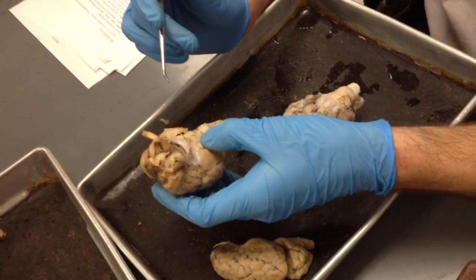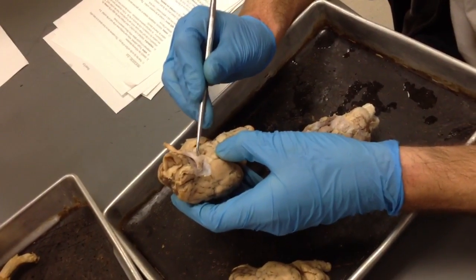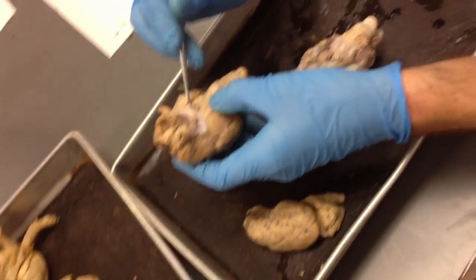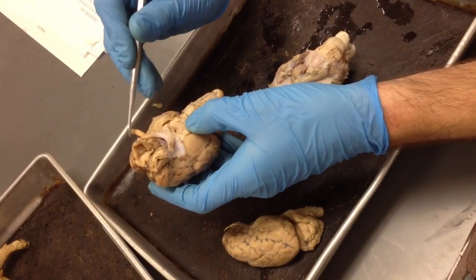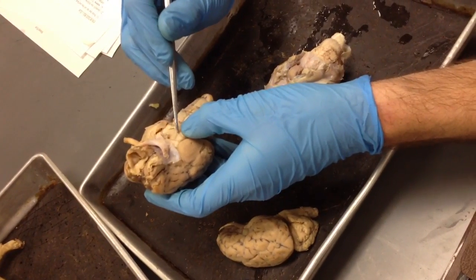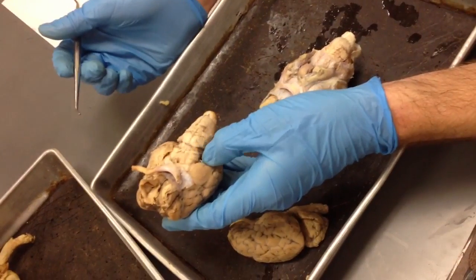The optic chiasma. So the optic chiasma is that nice X right here in the center, where the optic nerve, cranial nerve number 2, the optic nerve, sensory, from both sides meets up. So it goes cranial nerve number 2, the optic nerve, optic chiasma, infundibulum, mammillary body, or hypothalamus.